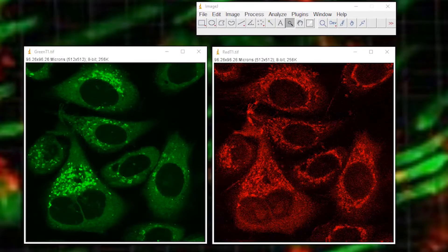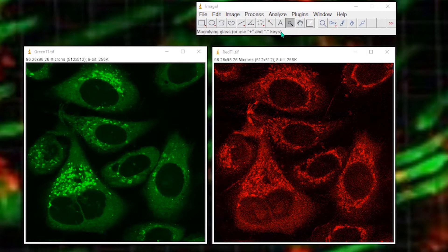Correcting your images before co-localization. I previously made a video on co-localization using the Just Another Co-localization plugin, and you can find that on the channel. I received a couple of questions about how else you might do co-localization, and I thought it might be worthwhile seeing why you would correct an image, or at least assess your image quality.